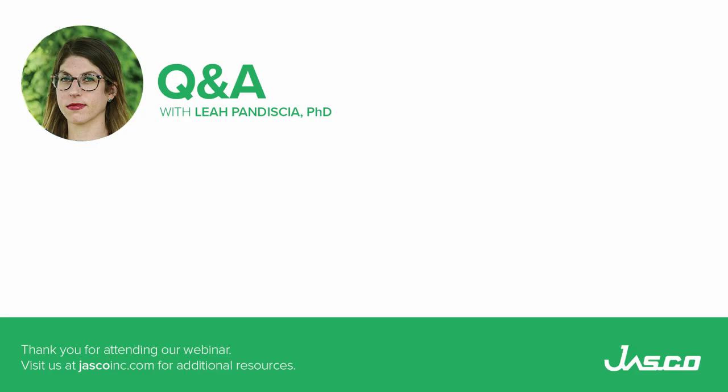Actually, an interesting point to that would be, okay, if I have a sample that I know is going to potentially scatter, I have no choice. I have to use the sample. I don't have an FTIR to use. CD is so much easier to use than FTIR in regards to secondary structure and protein samples.